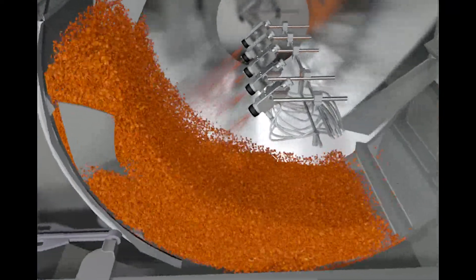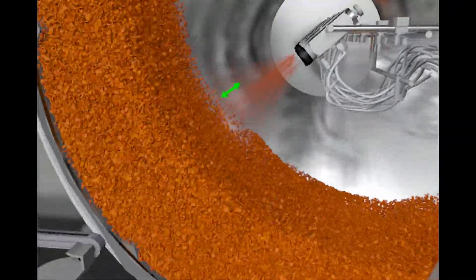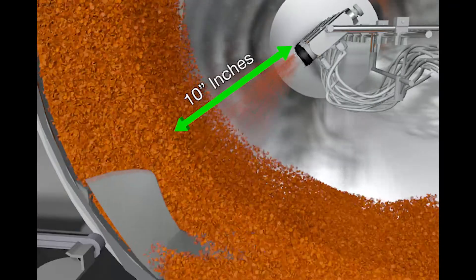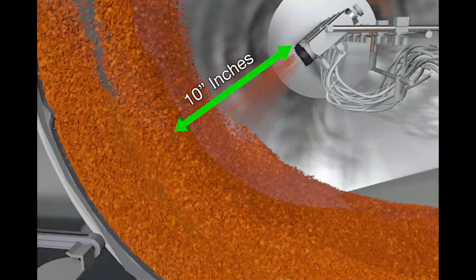Using a pump delivery system, the liquid coating is applied to the bed through the guns at a specific angle, rate and distance.